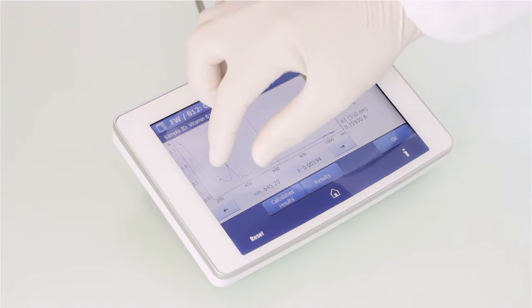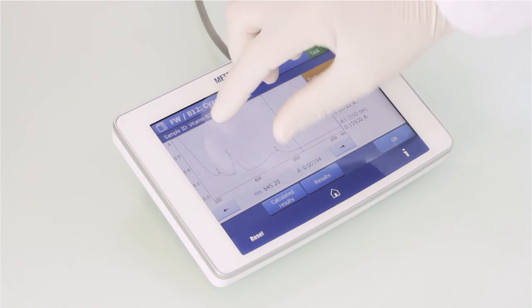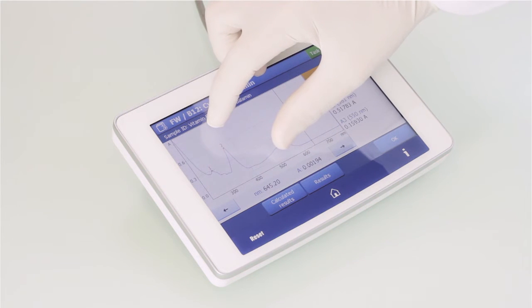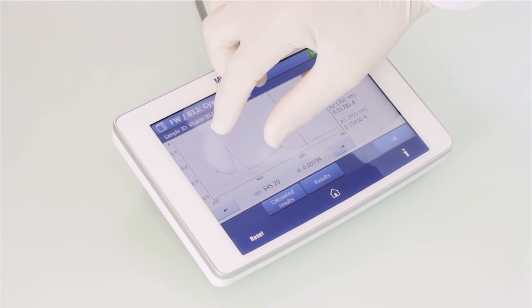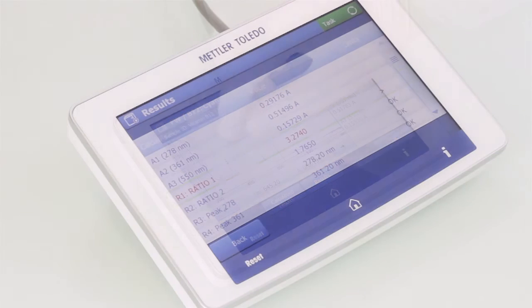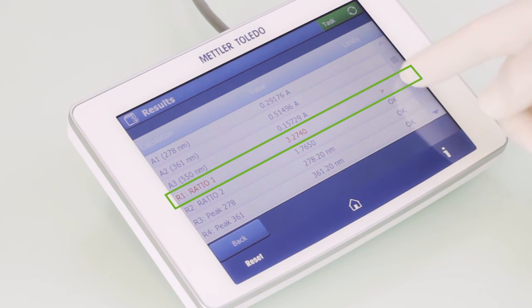In the detailed results overview, it can also be checked whether the results are within the limits given by the pharmacopeia. Any results outside of the limits would appear in red.